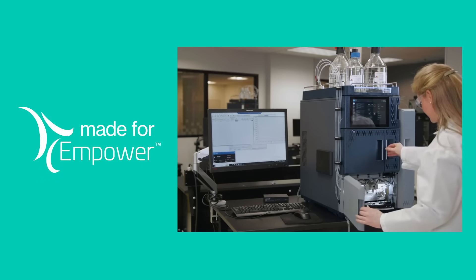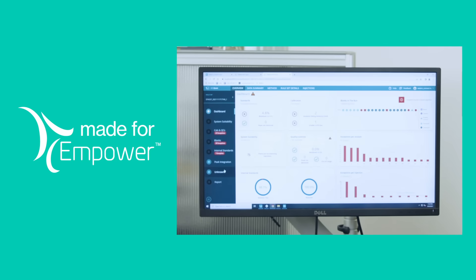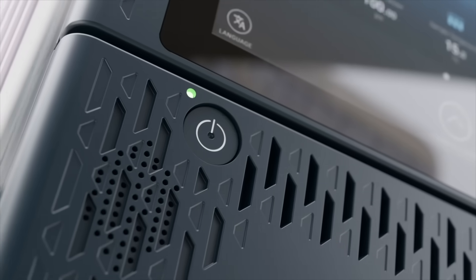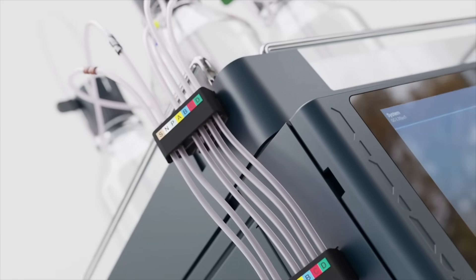The system is designed exclusively for Empower software to take care of your biggest asset: your data. And with the Waters product quality you expect, it's built to last.